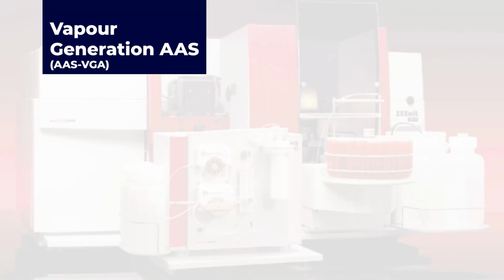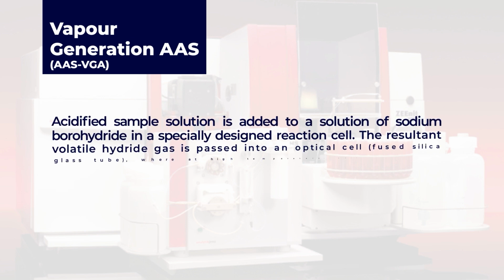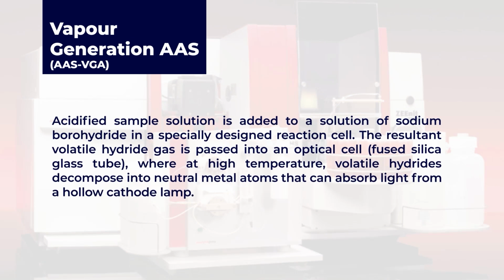So all of them are converted into hydrides. The resultant volatile hydride gas is then passed on to the optical cell, and all the further principle is the same. Basically, the elements which are volatile, which escape in the flame or cannot be done by graphite, are done by vapor generation, ASVGA, which is by formation first of the hydride and then of the hydride to gaseous atoms.